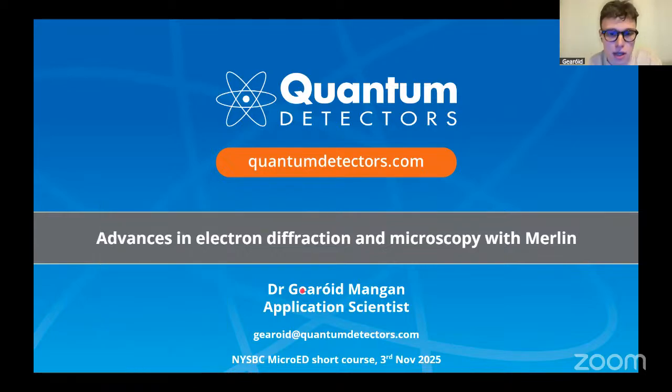So my name is Gearóid. I'm an application scientist at Quantum Detectors. First, I'd like to thank the organizers of this event for the opportunity for Quantum Detectors and myself to speak. Today, my talk is titled Advances in Electron Diffraction and Microscopy with Merlin. The overall goal of this talk is to give you some insights into how the Merlin has been used in different applications in electron diffraction and microscopy, specifically with a focus on MicroED and 4D STEM.